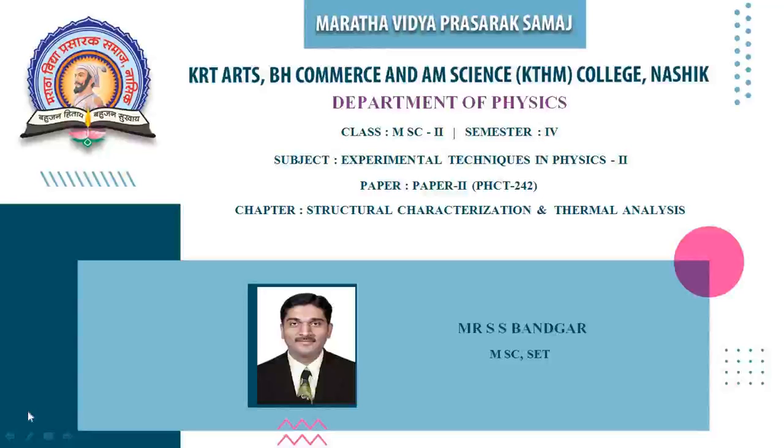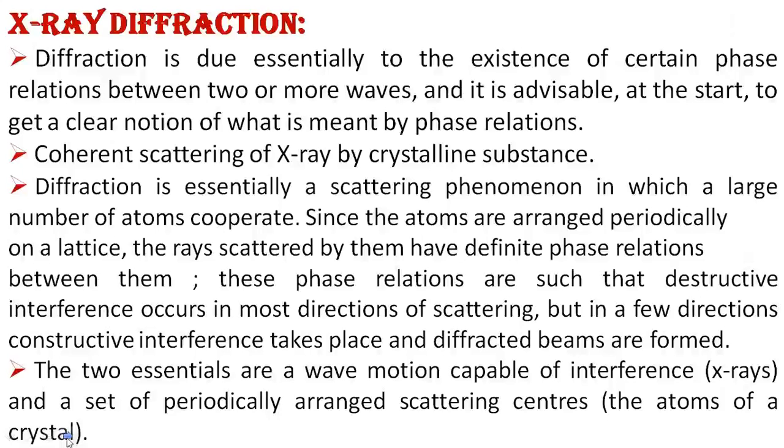Today we are going to discuss M.Sc second year, paper second, Experimental Technique in Physics, semester 4. Today we are going to discuss the chapter of Structural Characterization and Thermal Analysis. So starting with the first concept, X-ray Diffraction.